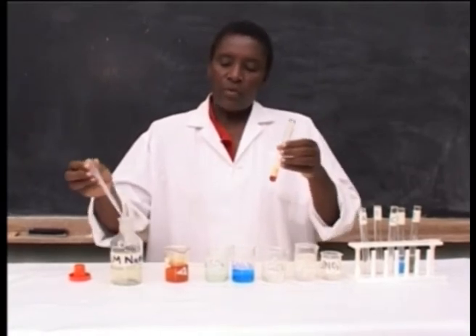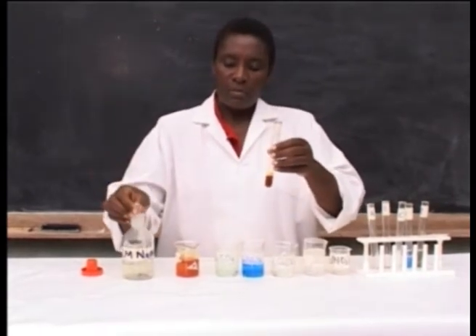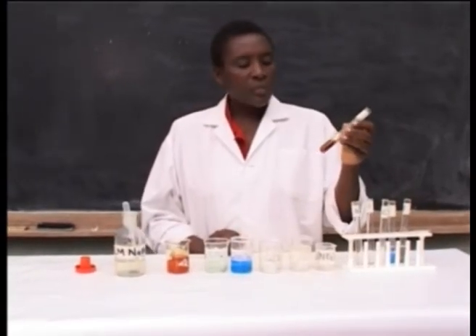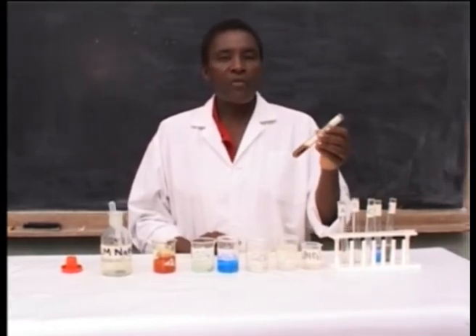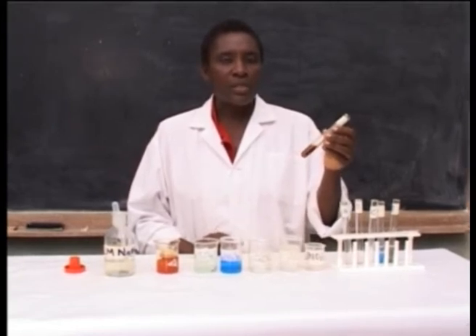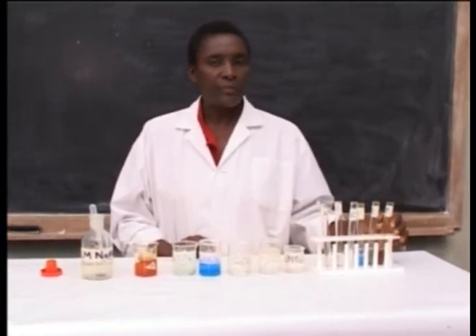Then we add excess sodium hydroxide. In excess of sodium hydroxide solution, there is a formation of iron 3 hydroxide, which is insoluble in sodium hydroxide solution.